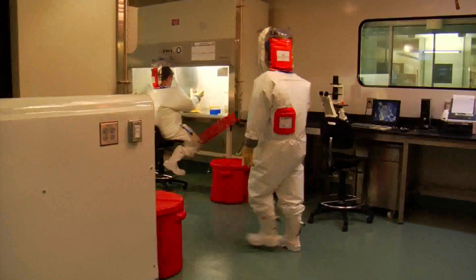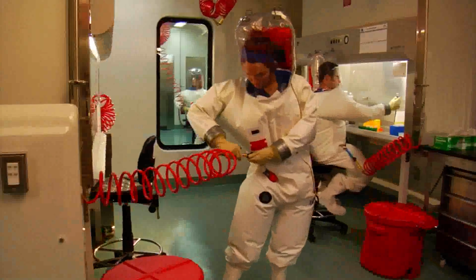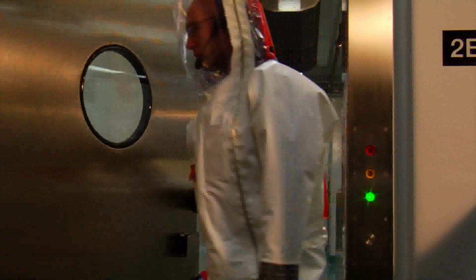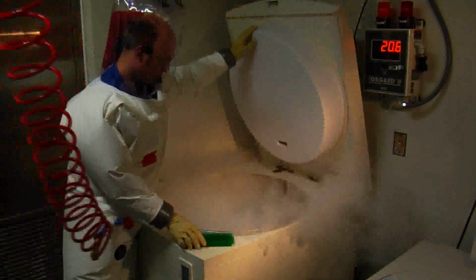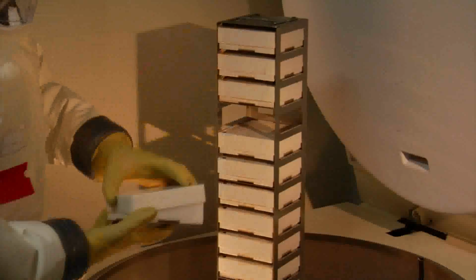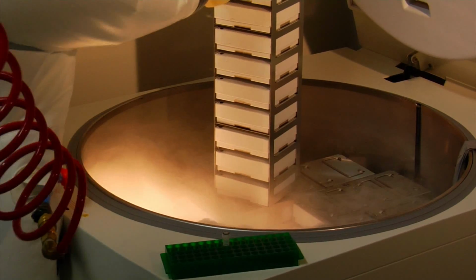The work in the Biosafety Level 4 laboratory is extremely challenging, both physically and mentally. Training is the most important part, but it's not any different from, let's say, a policeman or a firefighter. You know, you put people into dangerous situations, and if they're trained well, they handle those situations very easily and in a very efficient way. And that's the same as these laboratory workers. The suit is heavy. I mean, you feel the suit on your shoulders, and if you work long hours with this kind of equipment, it's demanding. Basically everything that you do in a normal laboratory is more complicated if you're in a positive pressure suit.